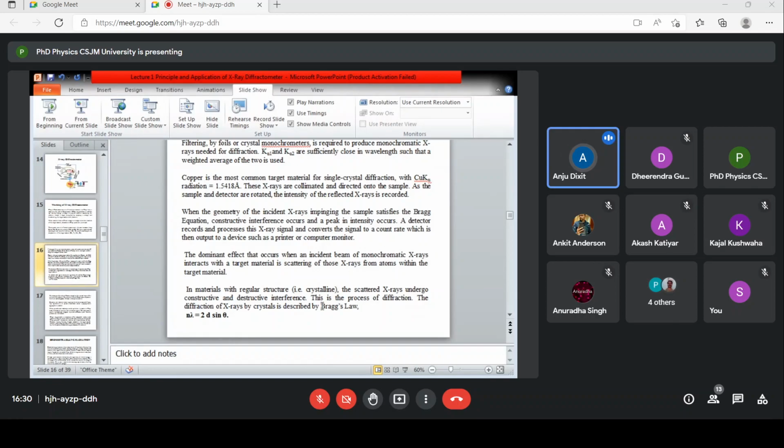तो इसमें हम दो तरीके की स्ट्रक्चर्स की बात करते हैं. Either we are talking about amorphous material which are having short range ordering. Short range ordering means they are not having ordering till long distance. उसमें कोई भी systematic crystal पैटर्न आपको फॉर्म नहीं होता है. That is why they are called as amorphous. और 7 क्रिस्टल सिस्टम में से वो किसी भी क्रिस्टल पैटर्न को फॉलो नहीं करते. They are short range materials.